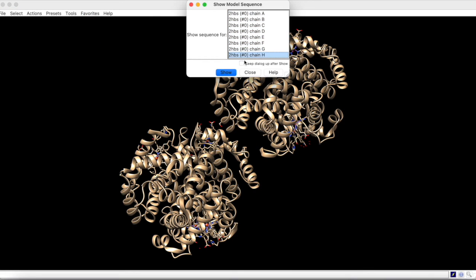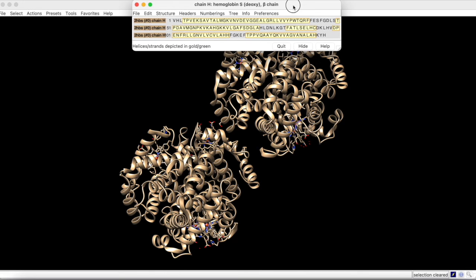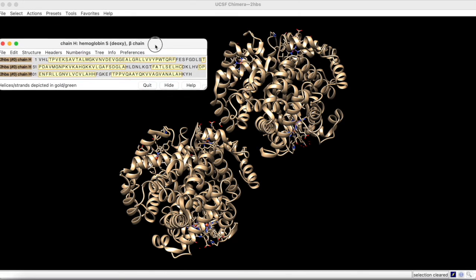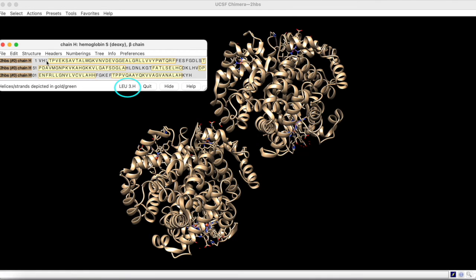Upon selecting chain H, we are greeted with the entire amino acid sequence of that chain. Hovering over each of these letters reveals the position ID label at the bottom of the window. In this way, we eventually come to valine 6.